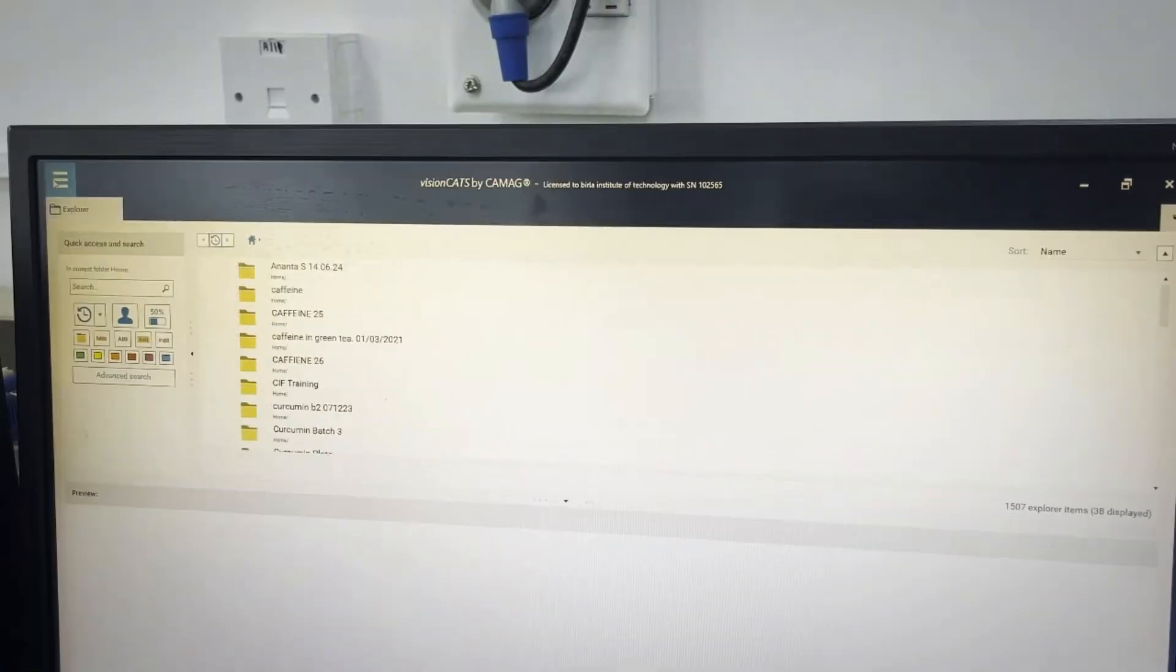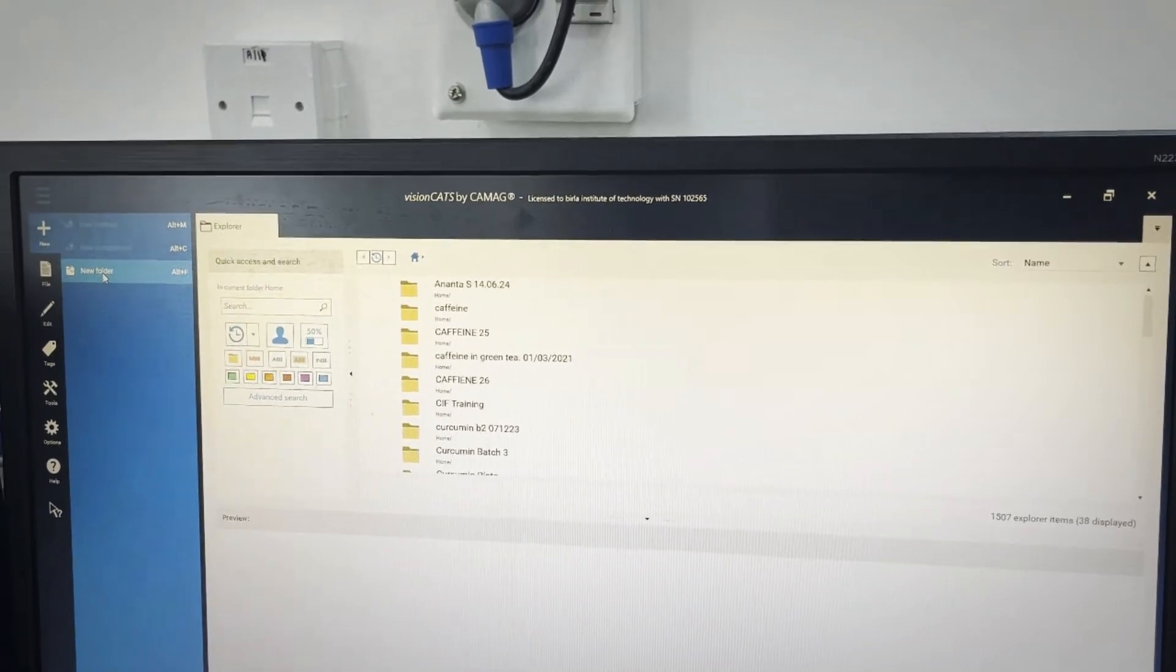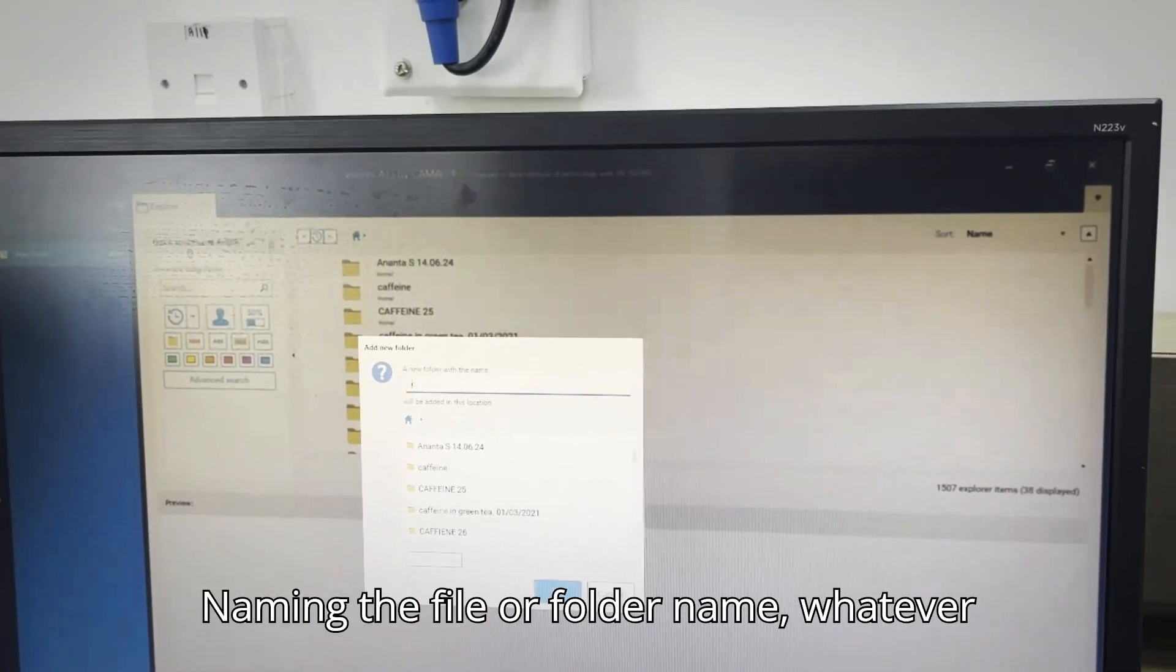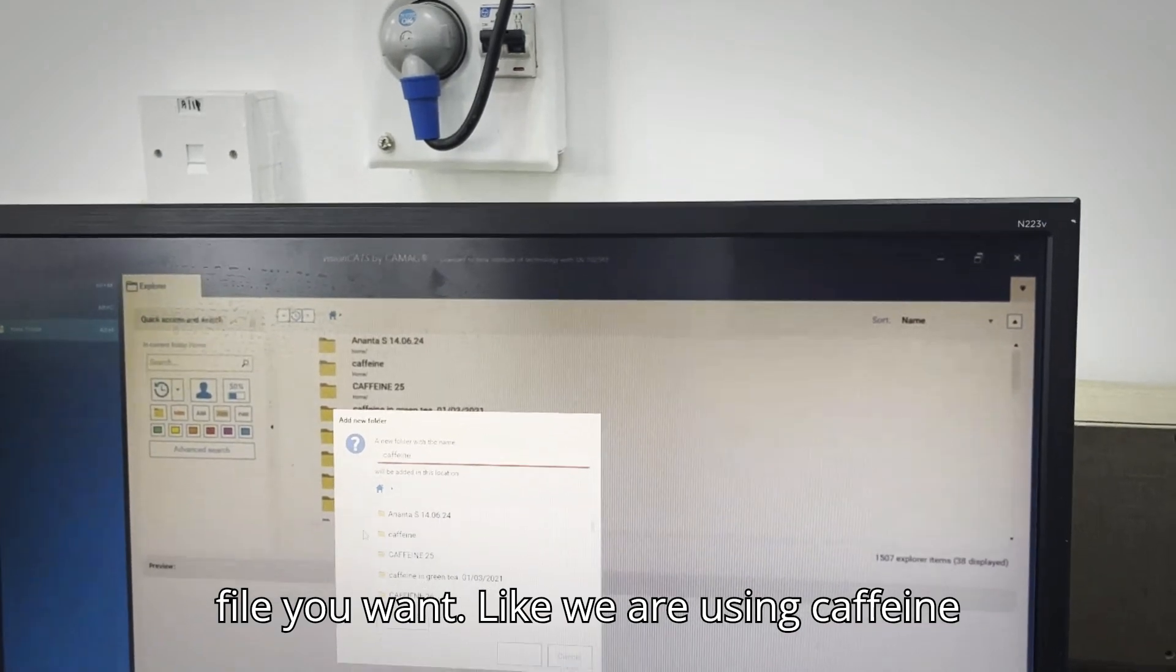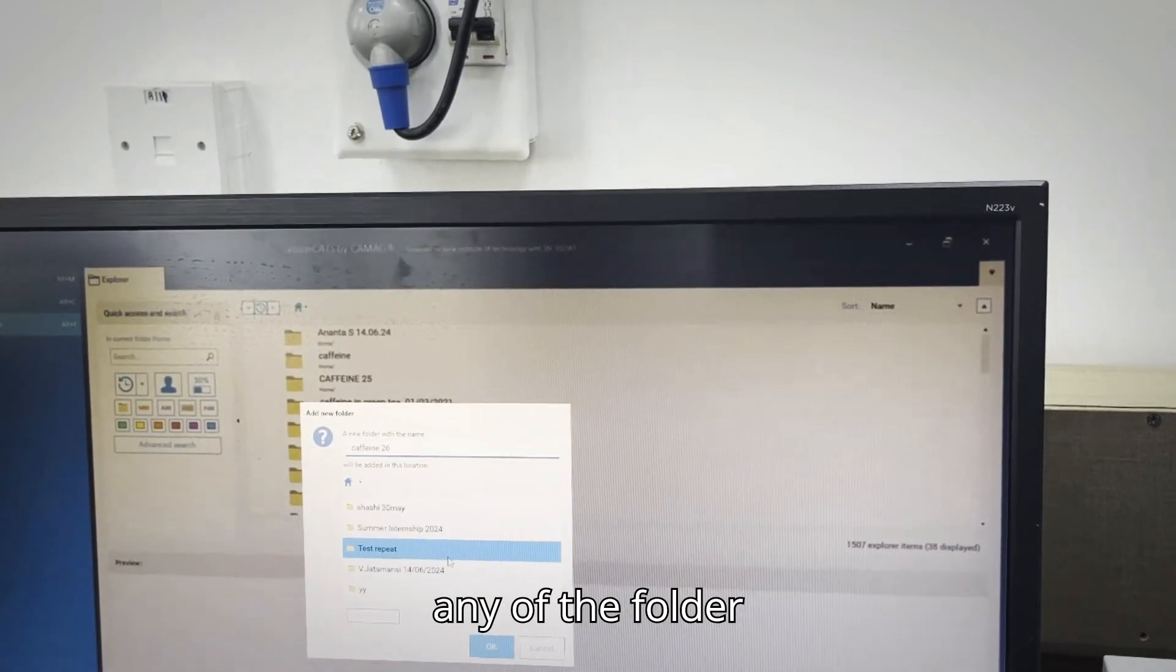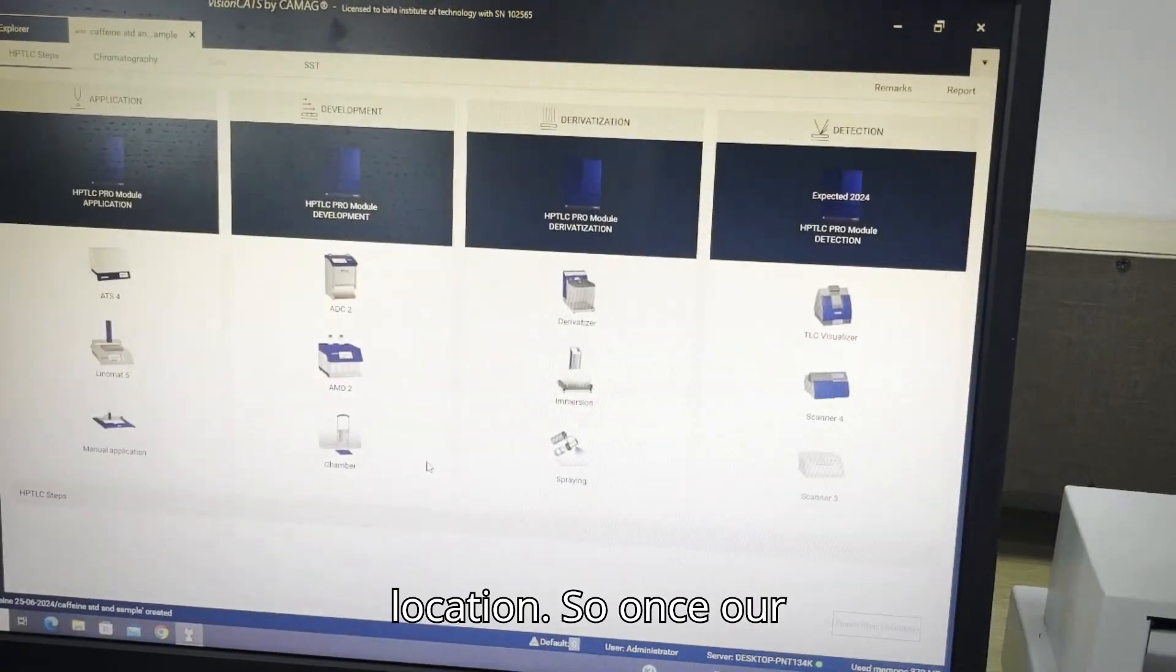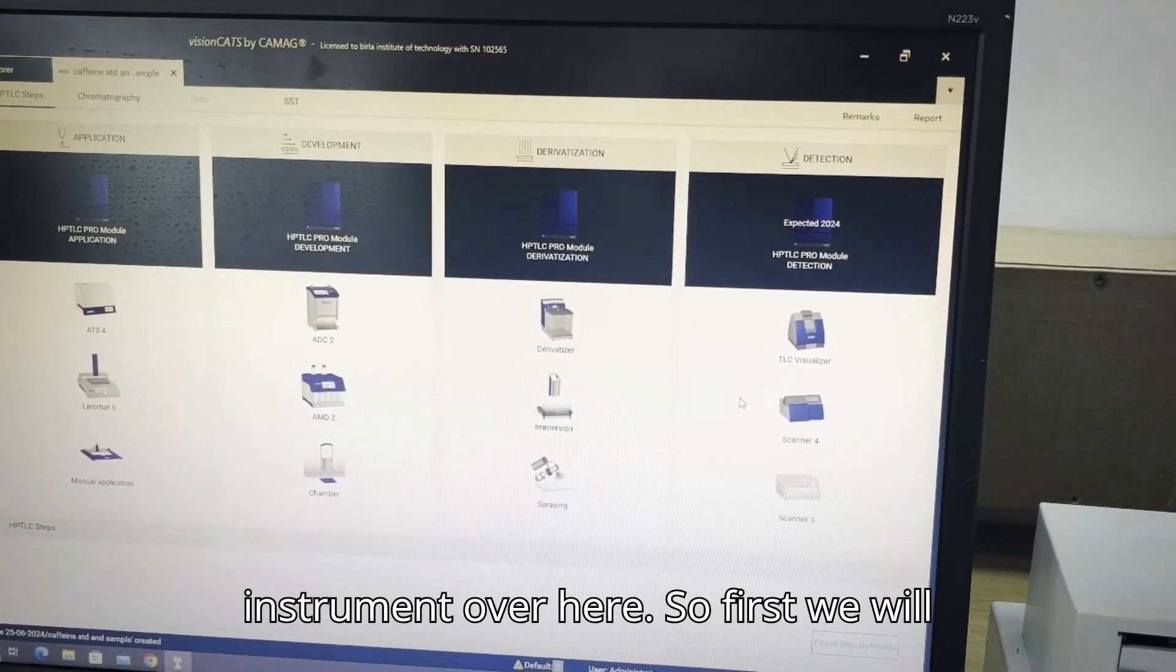After that we will open visionCATS software. In there we click on new folder. Then we will go to the new method. We will name the file, whatever file we want. Like we are using caffeine as a sample, so we have written caffeine here. We click on any of the folder or file where we are going to save the location. Once our file is saved, we will see the instrument over here.